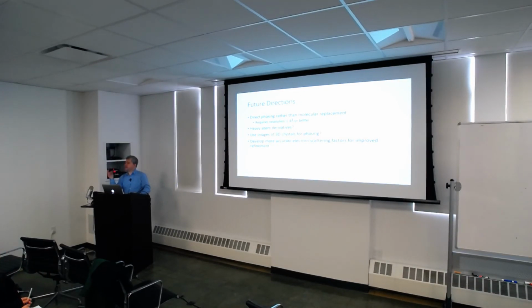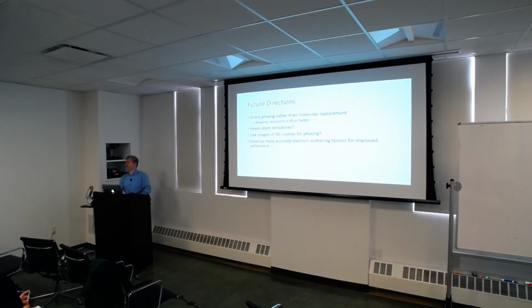Well, you could. The thing is, you can change the wavelength by changing the voltage. But then you'd have to realign the whole scope, probably. Maybe if you only change it by a few eV, I'm not sure. Aren't those parameters pretty set for each heavy atom, like the K edge? That's for X-rays. But you have to figure out how much a voltage change gives in energy. If it's a certain amount of energy, shouldn't that be the same no matter what source? Does it act differently when it interacts with the sample itself?